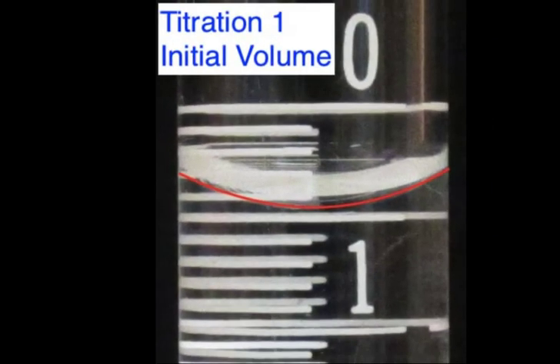And you do this for each of the images. Okay, so you're going to be recording to the 100th position for each volume measurement in a titration. Remember, typical procedure for measuring from an analog scale, which is what we have here, you're going to estimate the next digit down from the markings that's on the burette or graduated cylinder, whatever you're using. And since each mark is at 0.1 milliliters, that means you can estimate the 0.01 position. Now let's go back to the report sheet and see how we put all this together to calculate the concentration of vinegar.